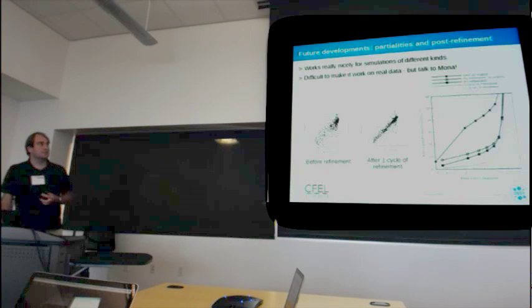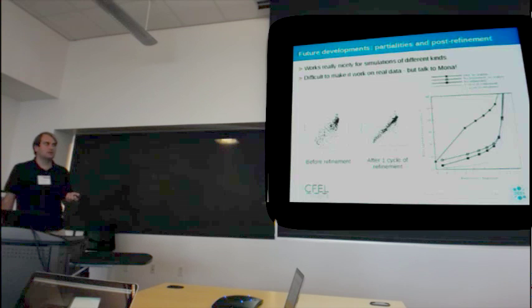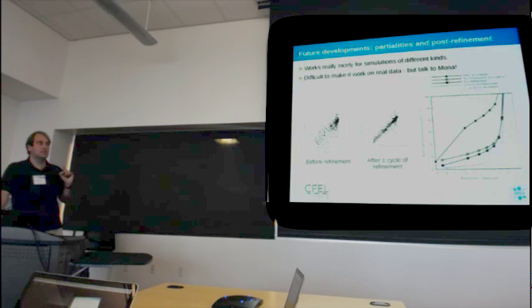So in simulations, this works. On the right is just a graph of how close we get to the correct answer, because we know the correct answer in the simulation. And you see that very quickly, with only one iteration, it's already taken a huge jump from this line here, which is what you get with the basic Monte Carlo unity model.